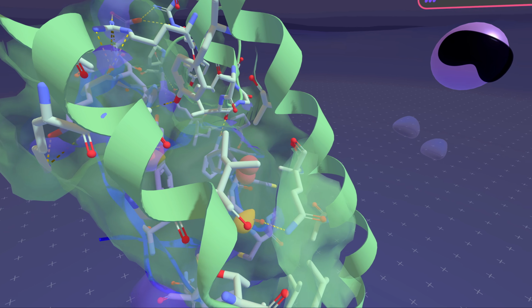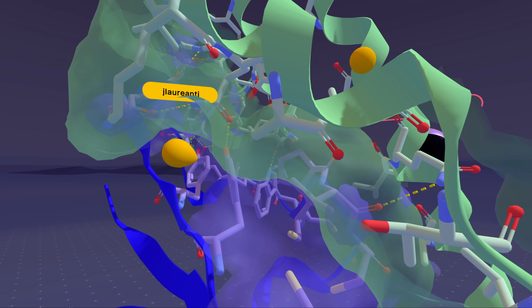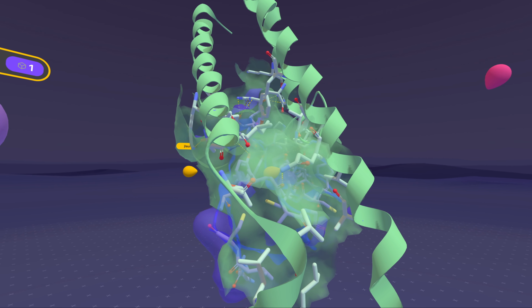Even so, they got this one interacting over here and this one up here as well. So even though they skipped a potential interaction, maybe something there would have made too much strain, or made it stick too much and not bent and been able to fit this alpha helix. But yeah, it's pretty cool.